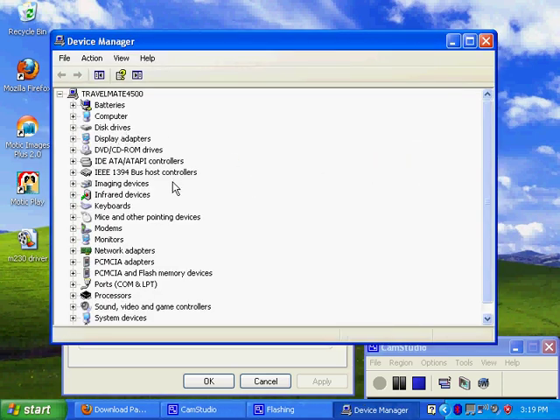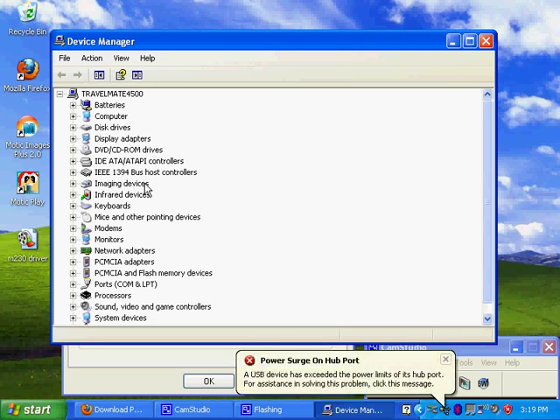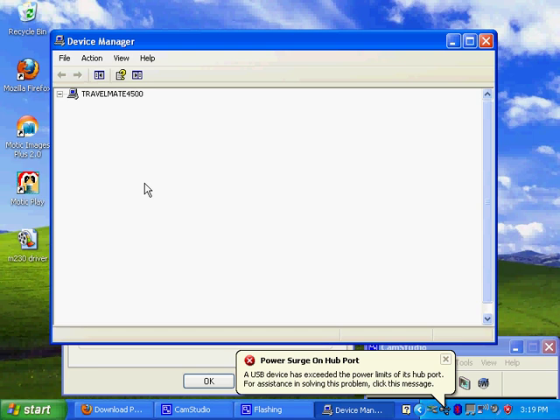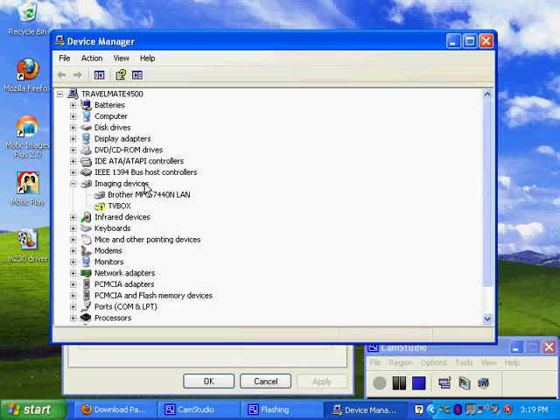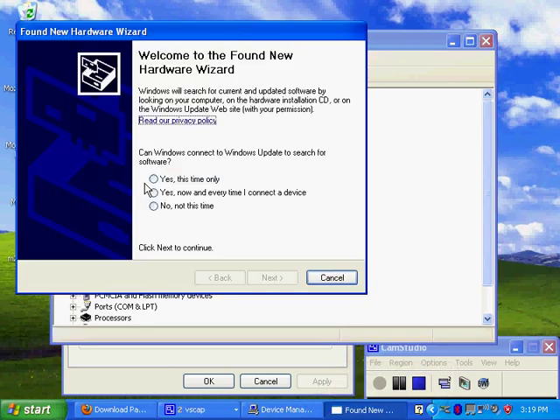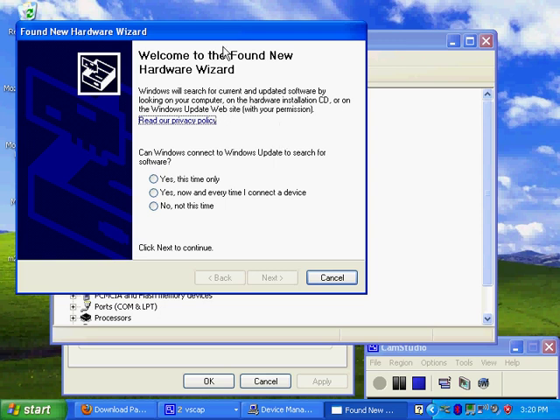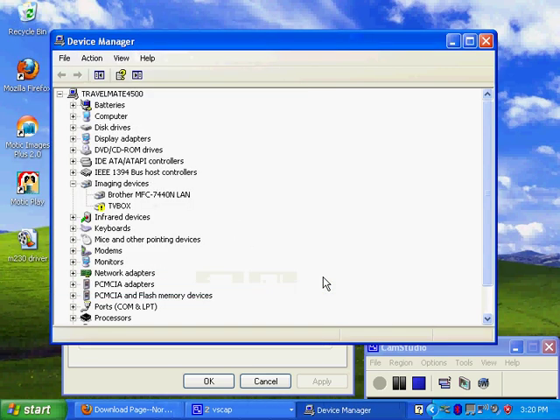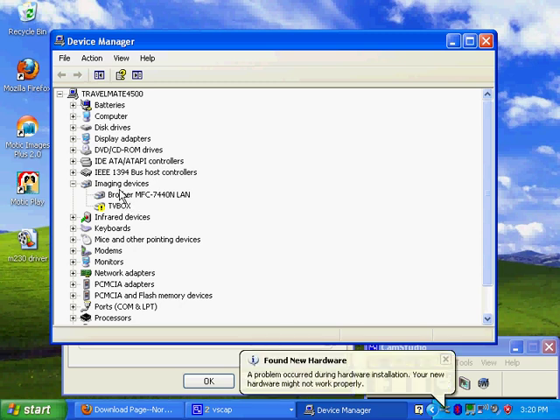Once you've reached here, please plug in your modicam or microscope USB cable to the computer, as I'm going to do so now. The hardware I'm using today is the DMB-1-223 microscope. All our modicams or products work the same way for installing driver. Once you've inserted the USB cable, a hardware wizard may pop up. I would like you to cancel this.